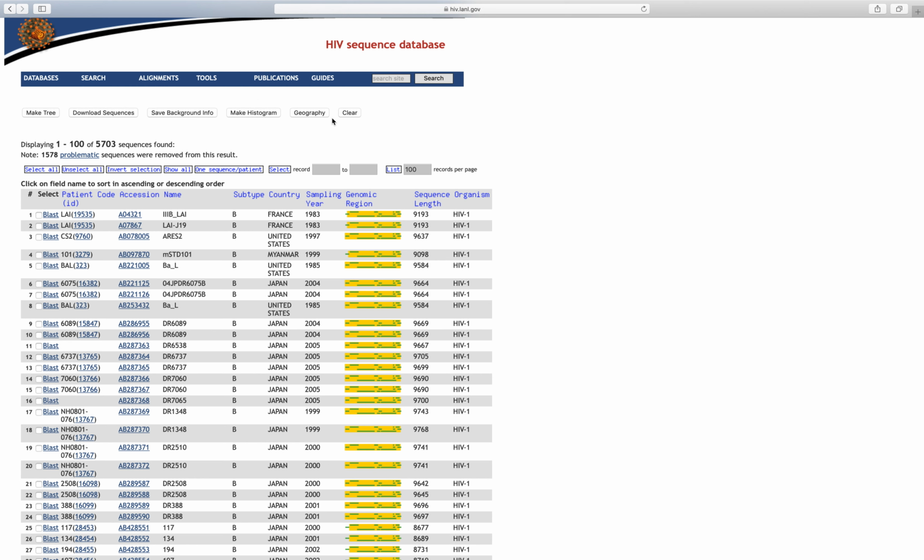Let's save some time. So what else do we have? We also have these little cartoons, which we'll look at briefly next, so that this makes a little bit more sense. But these little cartoons are actually representative of the genes that are in, and some of the features that are in HIV-1. And we can see here that there are two colors. There's green and there's yellow. So green is the interval of the feature, starting from the beginning of the virus on the left side to the end of the virus on the right side.